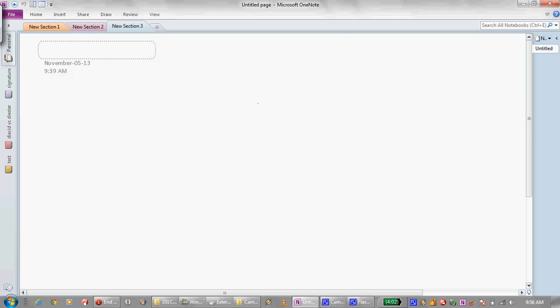Okay, so the idea here is that you're going to be producing two different species in your one pot reaction. So say for example you have propanol as your starting material. You're going to get bromopropane and chloropropane as products. And what you're going to get as far as analytical material to try and analyze your ratio of products is an NMR spectra.